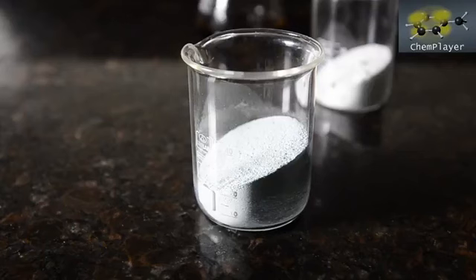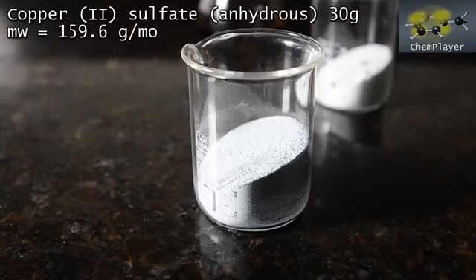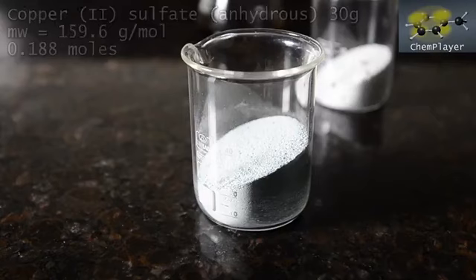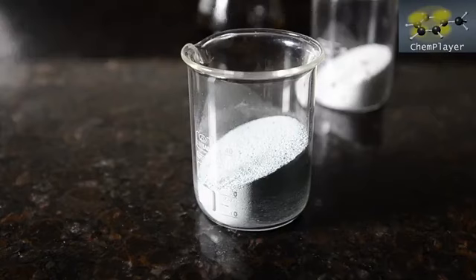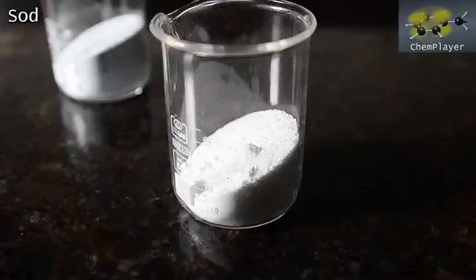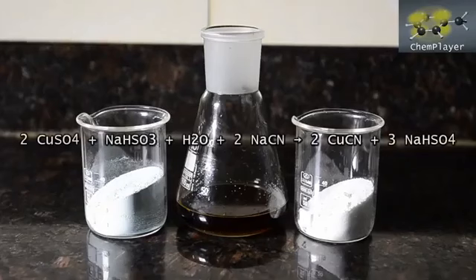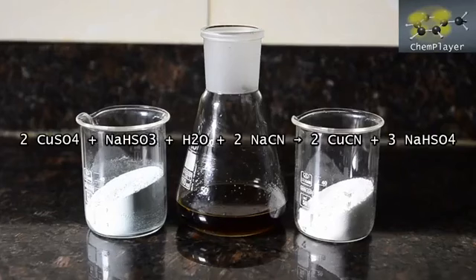It's the anhydrous salt, although after a year in our possession it has turned a very pale gray-blue color, as you can see. We're using 30 grams of this, which should hopefully be in excess of what we need to convert all the cyanide salts into the copper salt. And here's the reducing agent. 29 grams of sodium bisulfite. The expected reaction is shown on the screen, but we don't want to take chances with the dangerous side reaction, so this gives us a 50% excess on what we need.